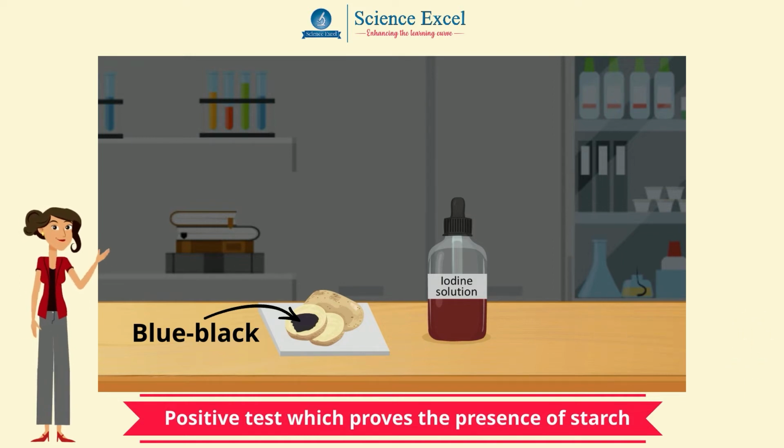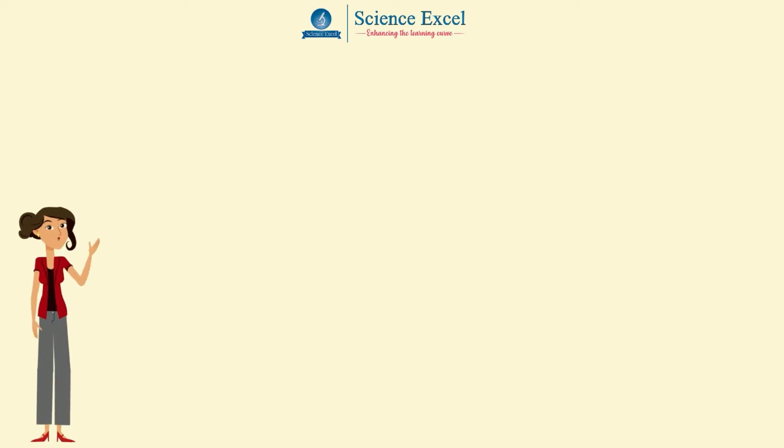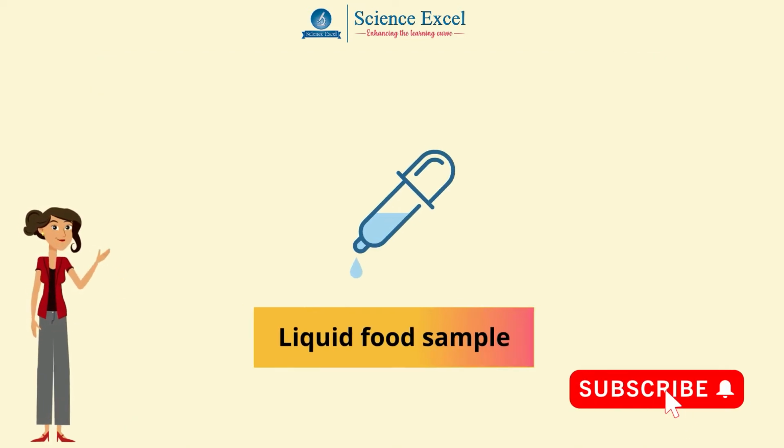If starch was absent, the original yellow or light brown color of iodine solution remains unchanged. This test can also be performed using a liquid food sample.